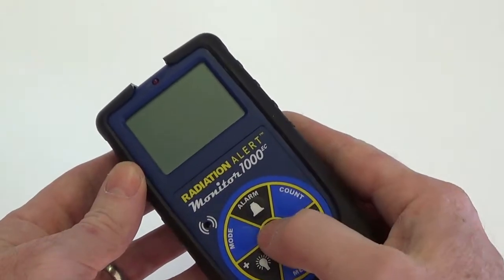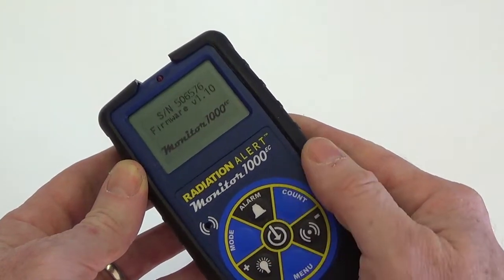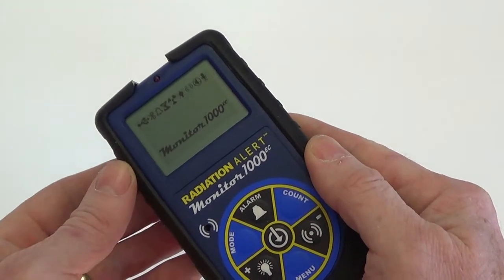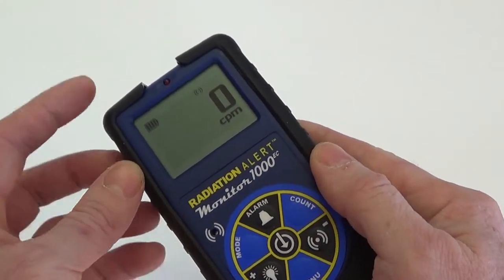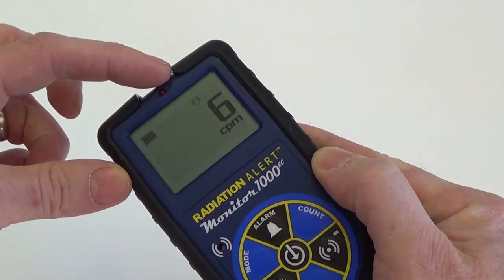To power on the unit, press the power button for a few seconds until the unit beeps. The boot cycle will show the serial number of the unit, the firmware version, and the last date of calibration, as well as a quick check of all the available icons. The battery icon shows the remaining power, and a small audio icon indicates that the audio is on.